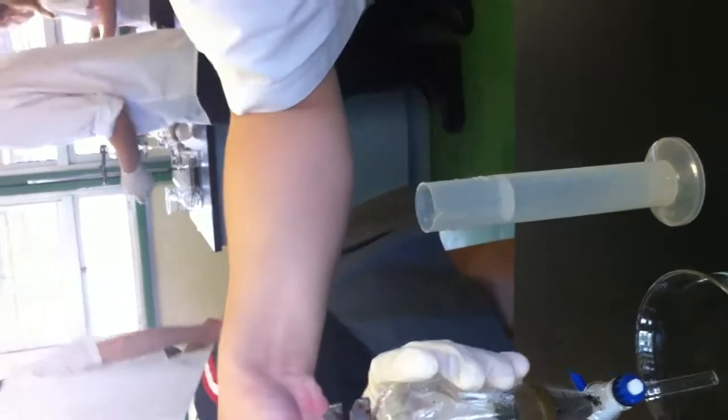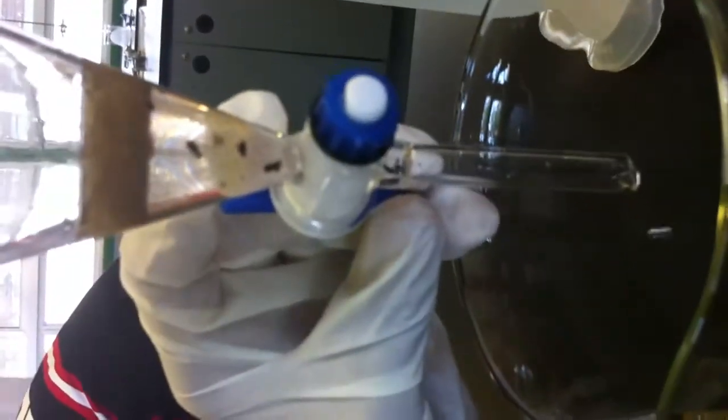That's it. I can see it clearly now. It smells like crap. It doesn't smell like orange at all. Okay. Yeah, I think it's enough. Yeah. Yay! It's fully clear. Yeah, okay, we're good. So, can we smell it? Oh, we're decanting it again. No, but it's an ester, just the color change.